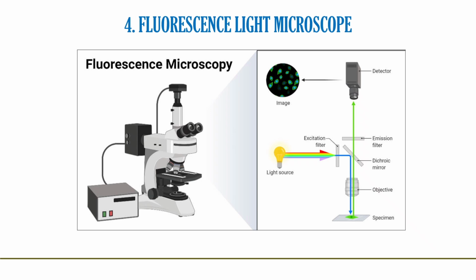Alternatively, the intrinsic fluorescence of a sample, i.e. autofluorescence, can be used. In the life sciences, fluorescence microscopy is a powerful tool which allows the specific and sensitive staining of a specimen in order to detect the distribution of proteins or other molecules of interest. As a result, there is a diverse range of techniques for fluorescent staining of biological samples. Biological fluorescent stains. Many fluorescent stains have been designed for a range of biological molecules.